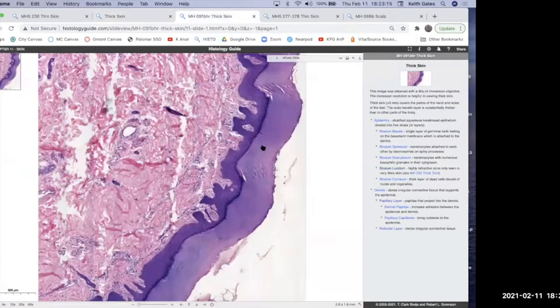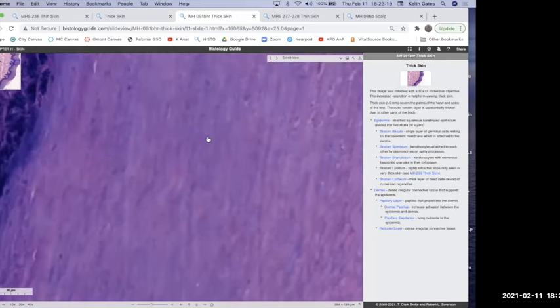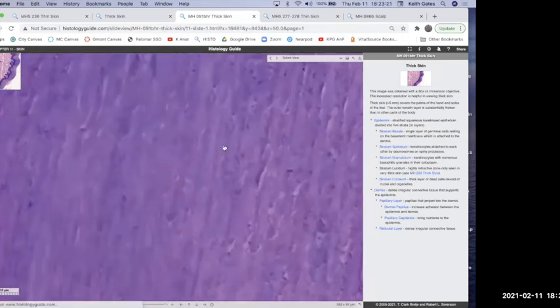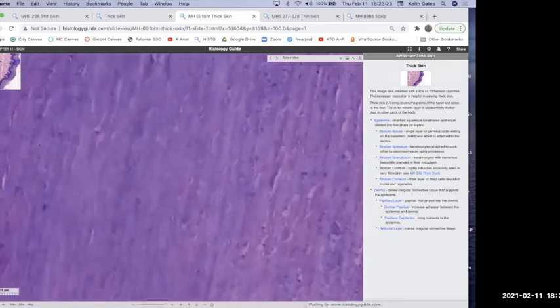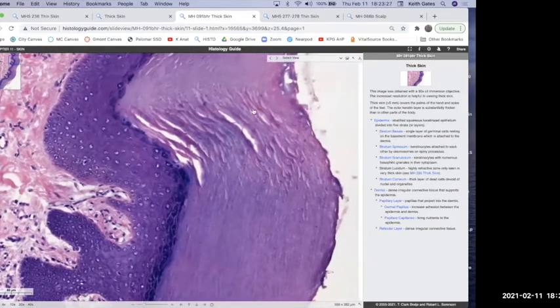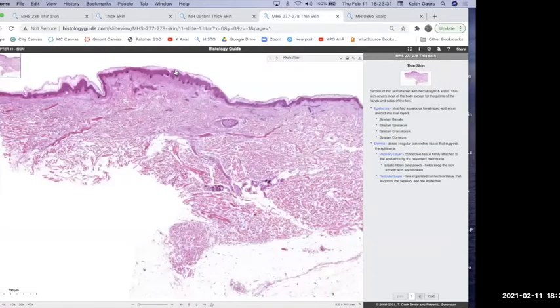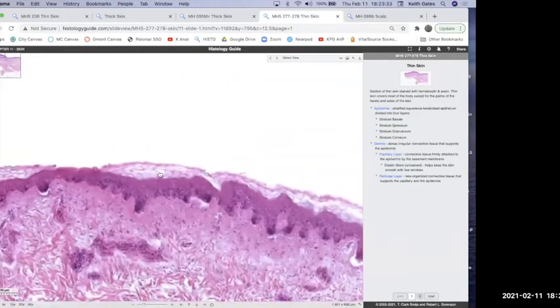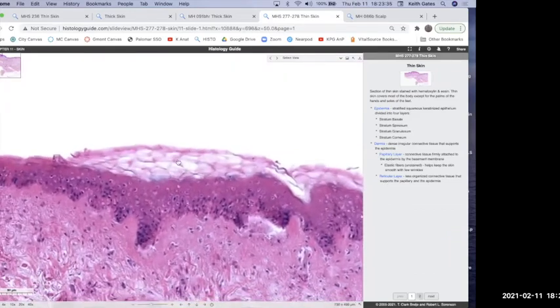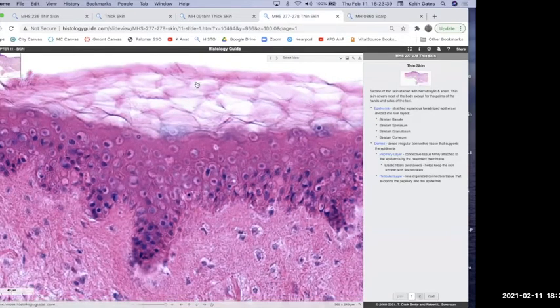On this sample, it looks a little bit different. You can't really make out the cells anymore, but you could definitely tell it from anything below it right over there. It's starting to flake off over here. And then for this thin skin sample, it's the most degraded for the most part, most flaking off, right? There's still some kind of attachment, but this is that stratum corneum versus the underlying living layers right over there.